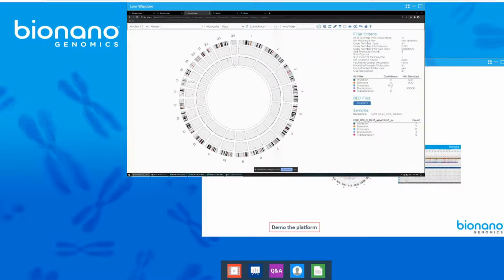So for example, in this case, if you look at chromosomes 23 and 24, which are X and Y, respectively, you will see that chromosome 23 is at level 2x and chromosome Y is 0. So this case is 46XX because there is no other structural variations present.